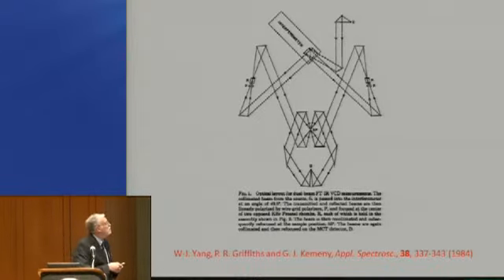So the way that we came up with was to take the light from the source, collimate it, pass it into the interferometer a little off the usual axis, so that you could pick off both beams coming off the spectrometer, pass them through a polarizer, this time through a Fresnel rhomb rather than a photoelastic modulator. And we're doing this with both beams, crossing them through the sample, so that both beams are passing through the sample, and then passing them onto the same detector.